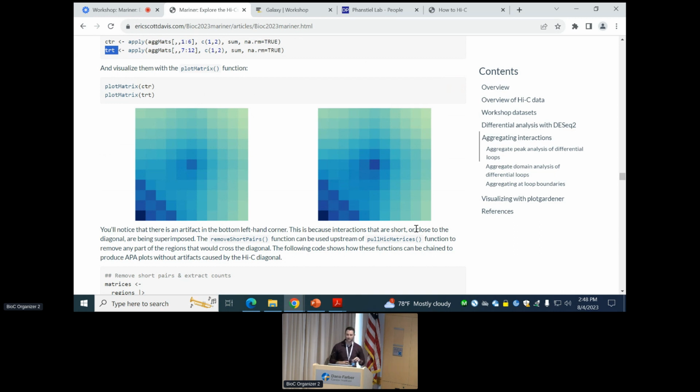And so this is what our HiC data looks like at this point. What you'll notice is that there's an artifact here in the bottom left corner. And this is because sometimes interactions are, oh yes, sorry, question.